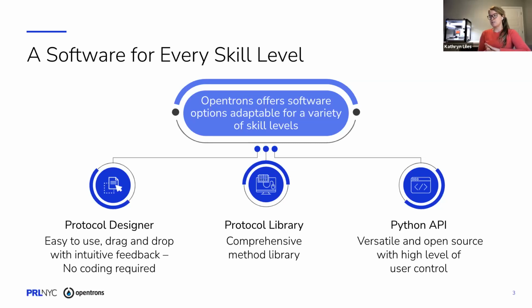We discussed the Python API in a previous webinar, so it's an excellent resource if that's your interest. And also keep in mind that there's also a fee-based option where an application engineer from the Opentrons team can build a customized protocol for your workflow.